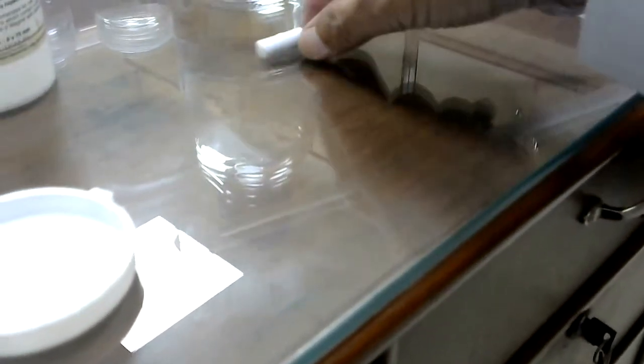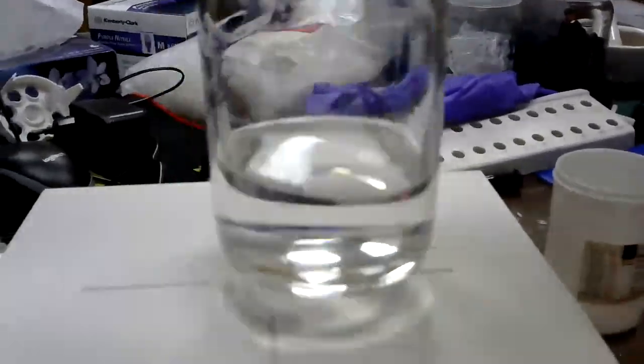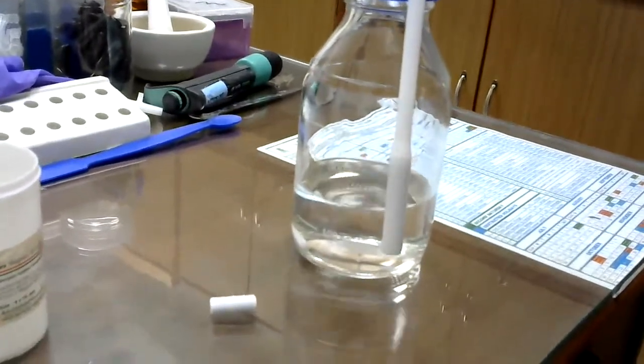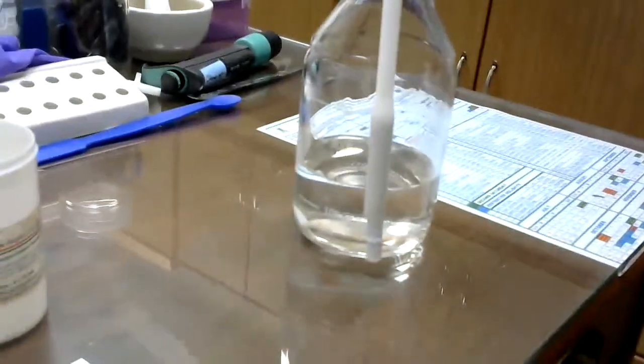Okay. So say for example, this is that bit, and suppose that this is inside this one. You have to take the bottle outside of this magnetic stirrer, and then dip this inside here. Like this, and then this magnetic bit will come out.